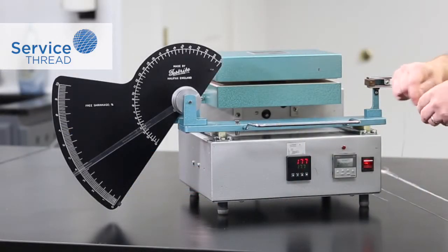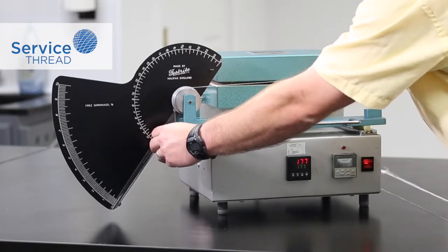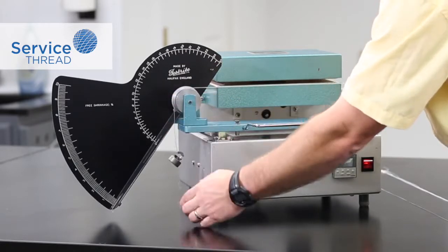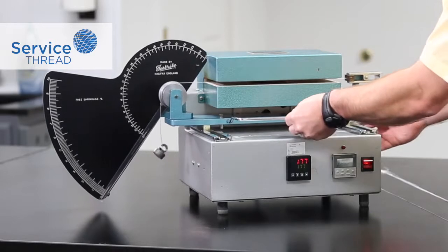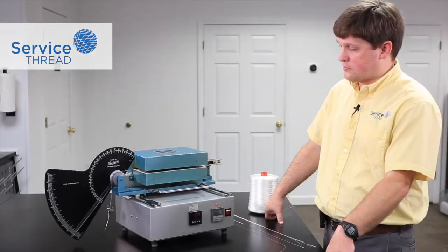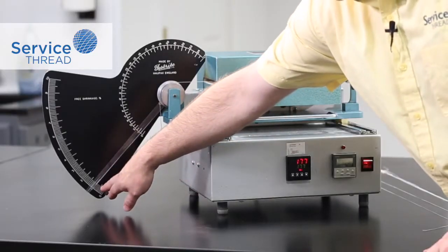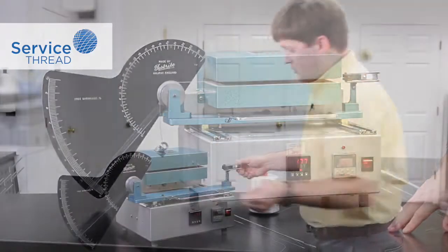I'm going to secure the 50 gram weight to the yarn and put the yarn in the clamps, resetting the scale to zero, and we're going to wait for two minutes and read the result. When the timer expires, you read the shrinkage value in percent on the scale. This particular sample has a shrinkage of 1.2 percent.